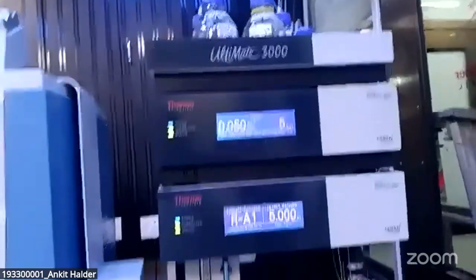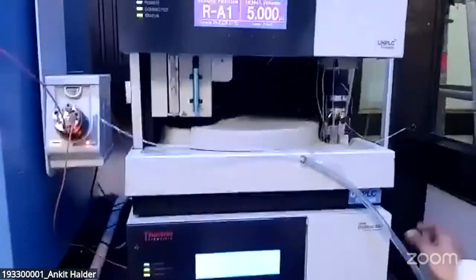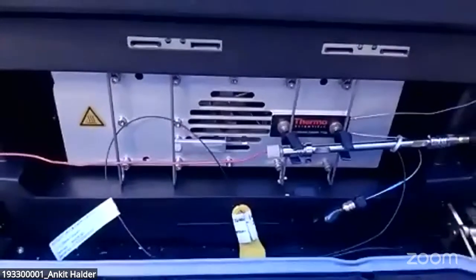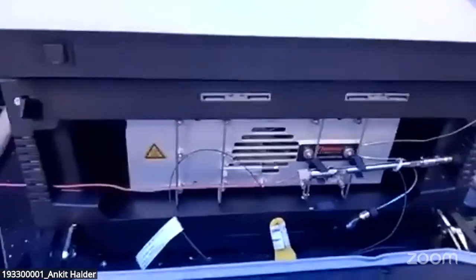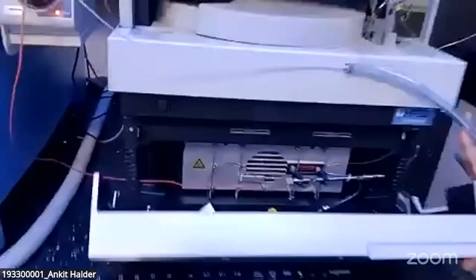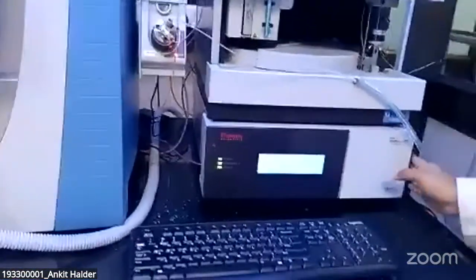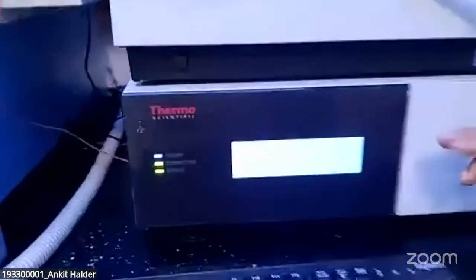The very first compartment is the column compartment. So here for lipidomics we use a CSH column, and for metabolomics we use a C18 HSS T3 column. Now one of the very important technical features of this column compartment is the thermostatic mechanism. Basically it provides passive and active heating of the columns.